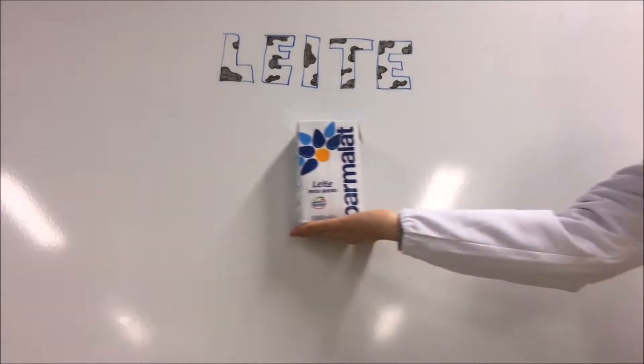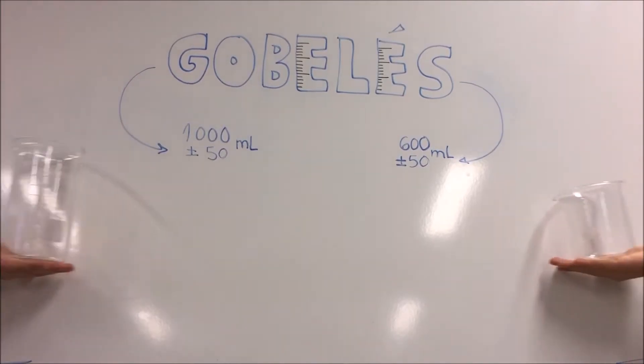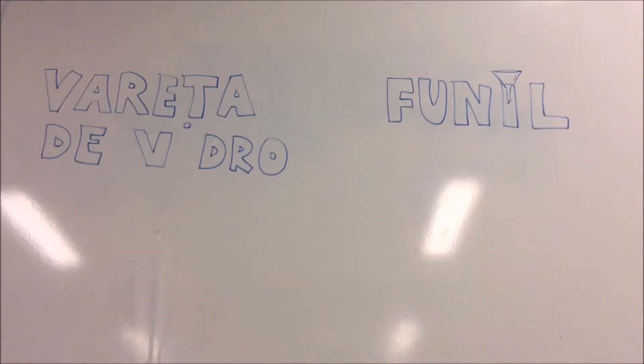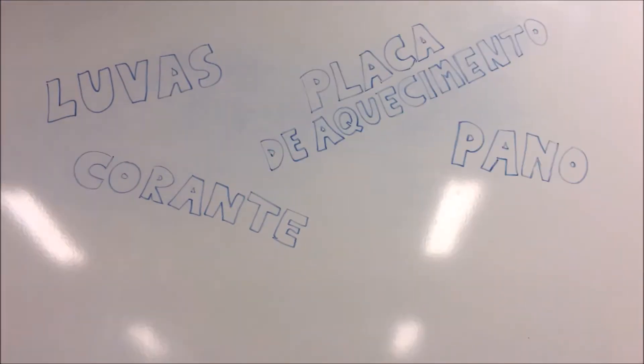For this experience we used milk, acetic acid, two beakers of different capacities, two graduated cylinders of different capacities, a glass rod, a glass funnel, disposable gloves, food coloring, a heating plate and a cloth.